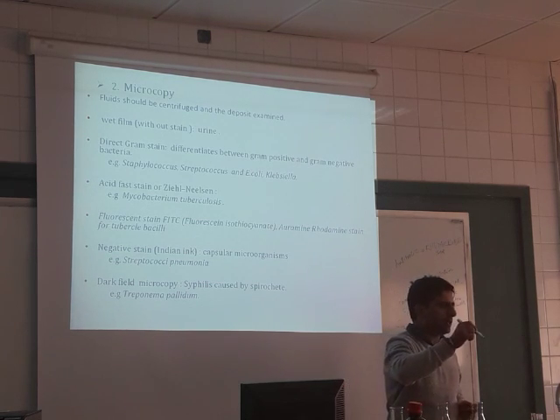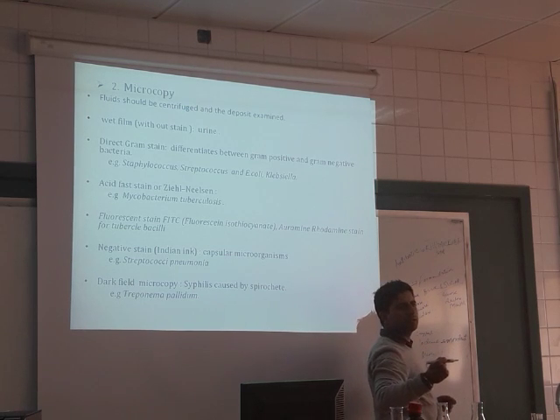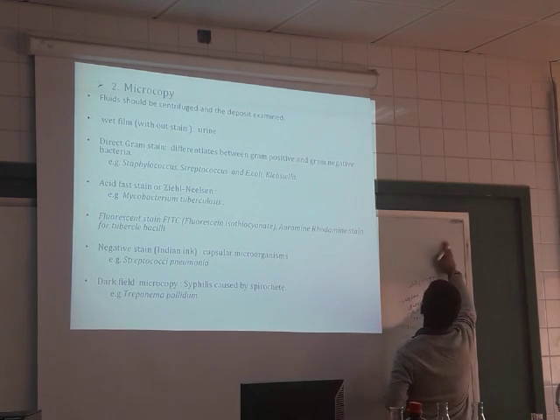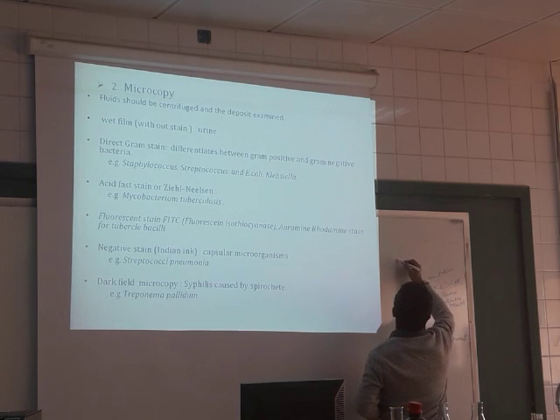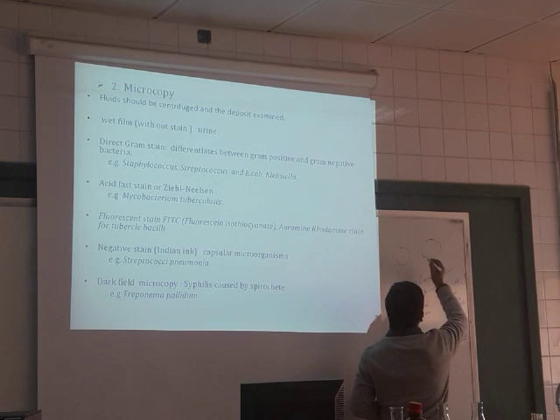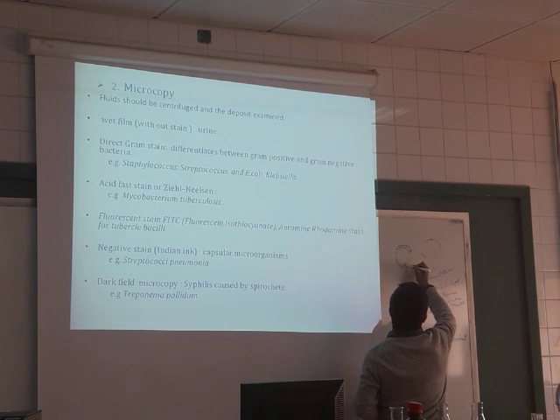When you add the crystal violet, now tell me what is the difference between gram positive and gram negative? What is the structure of gram positive and gram negative bacteria?